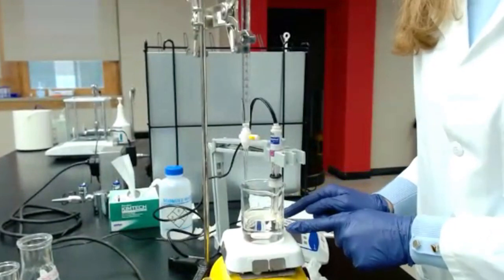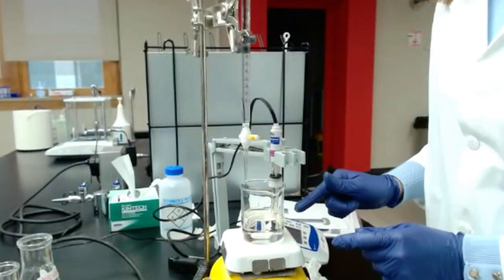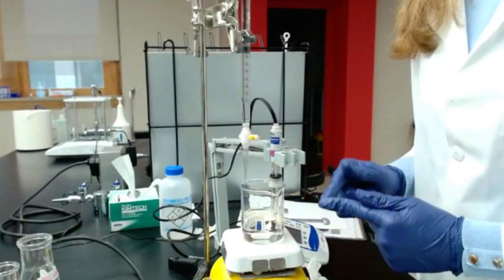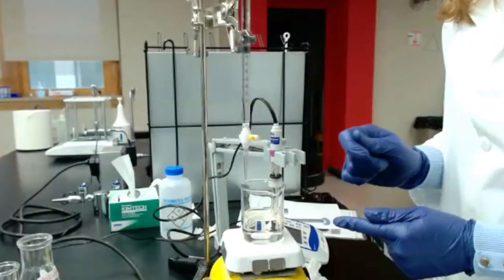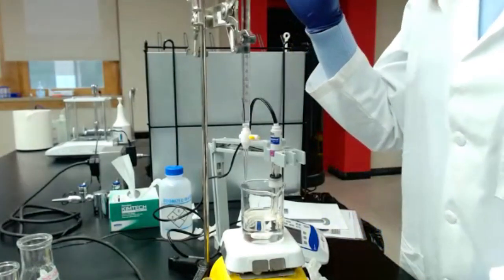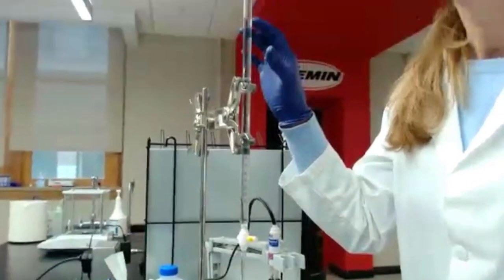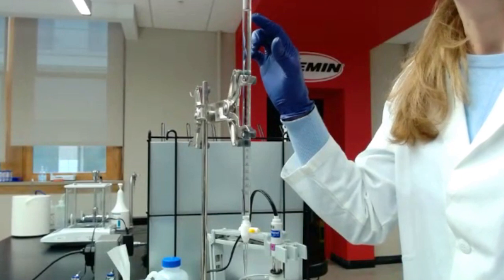In your beaker, you should have the stir bar, the 100 milliliters of water, and the 5 milliliters of juice. Record 5 milliliters in your notes. Take note of the volume of juice you used. Then the first thing you need to do is look at the volume in your burette. That's what we call the initial volume.